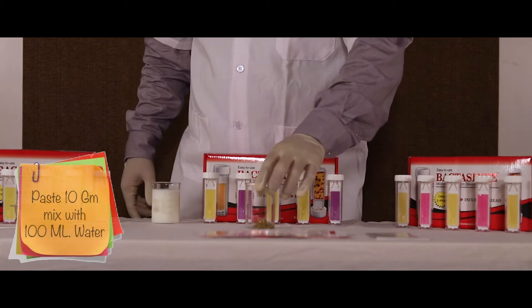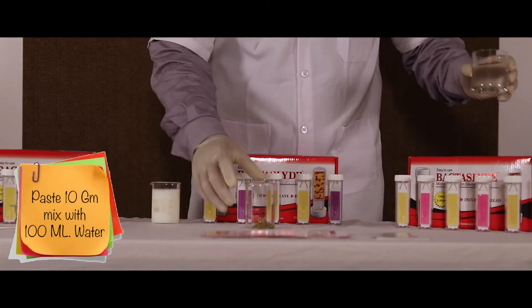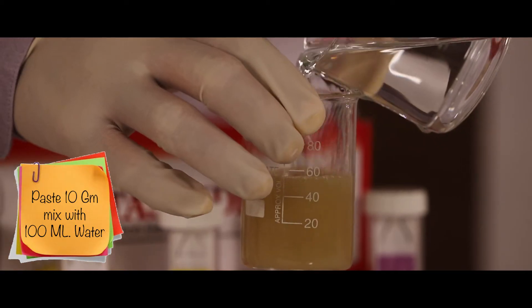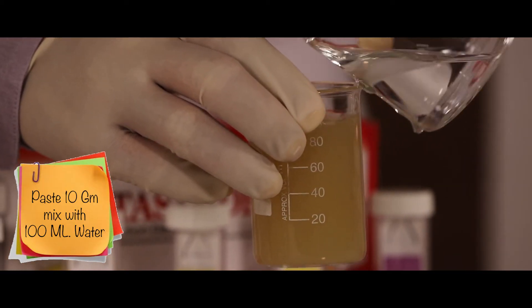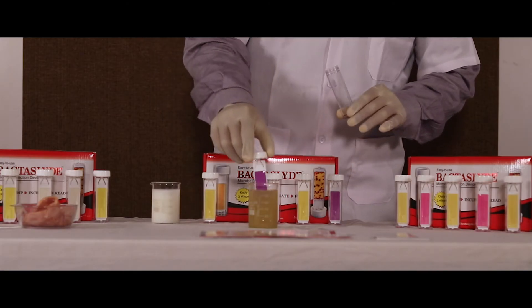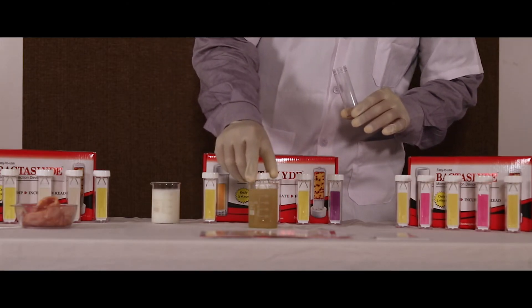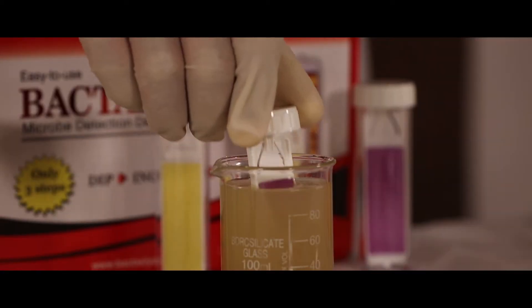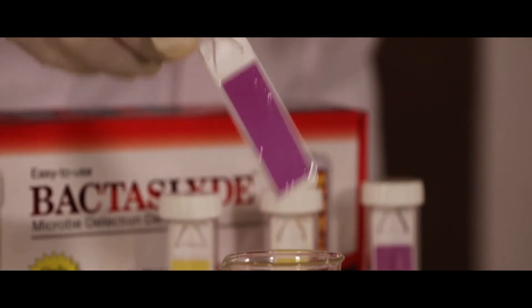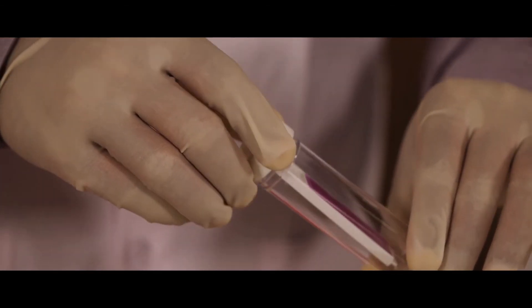For paste, take 10 grams of sample and dilute using 100 ml of sterilized water. Unscrew the slide and place it in the sample solution for 30 seconds. Gently shake off the excess and then screw the slide back in the tube. Allow it to incubate for 18 to 24 hours at room temperature.